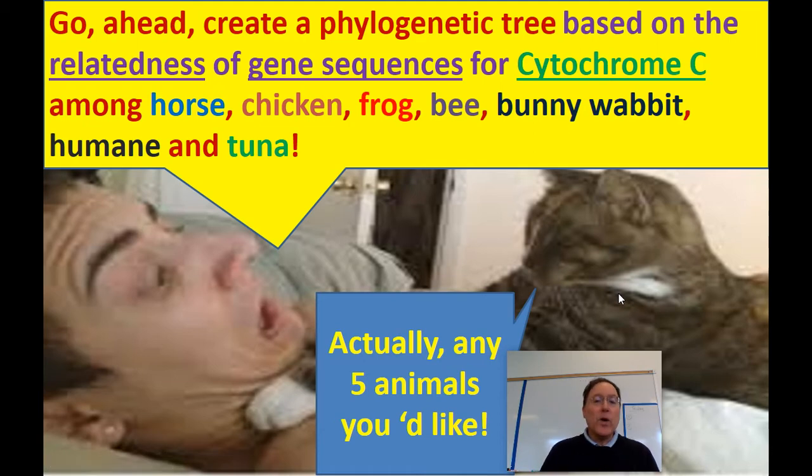We have these computer programs that you'll see when you watch Mr. Anderson's video at the National Institutes of Health, and they're very powerful computer programs. The idea is that the computer is going to do the work for you. We can look up these sequences of amino acids created by DNA or gene sequences in these organisms, and they're going to be a little bit different from one another. Based on those differences or similarities, we're going to try to create a phylogenetic tree.